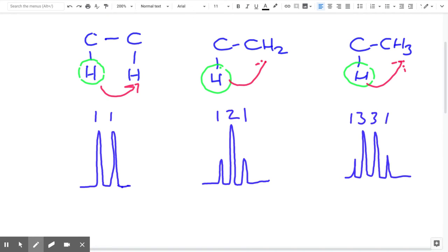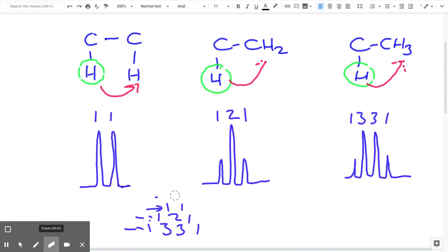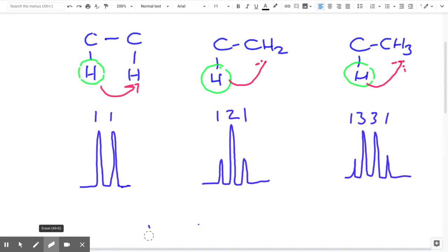Now, mathematicians amongst you will start to recognize those numbers as being lines from Pascal's triangle and various statistical models coming through that. But you see the first row next to 1 proton, and then obviously 1, 1, 1, 2, 1, 1, 3, 3, 1, etc. as we get more complicated down the molecule.